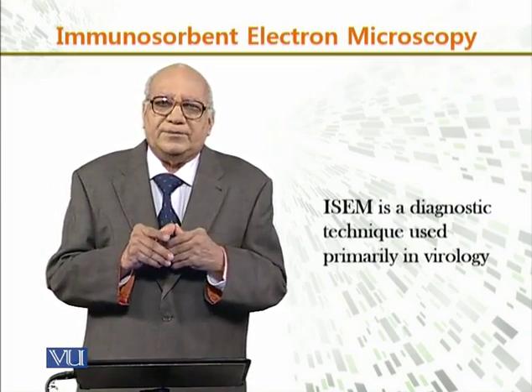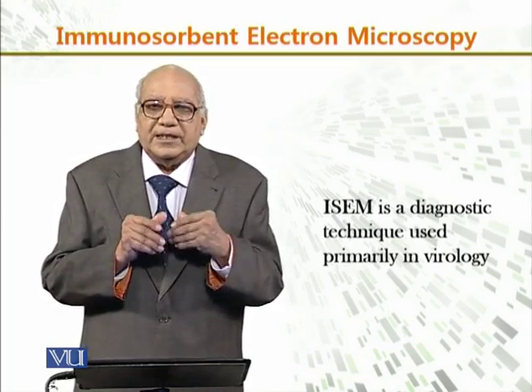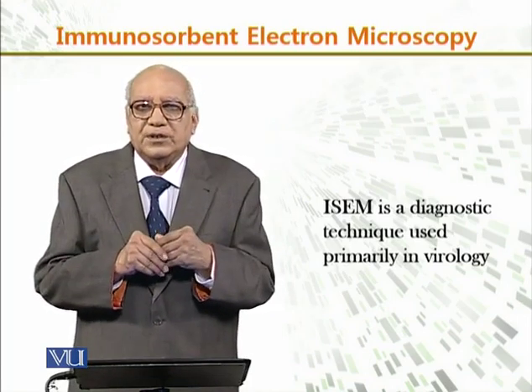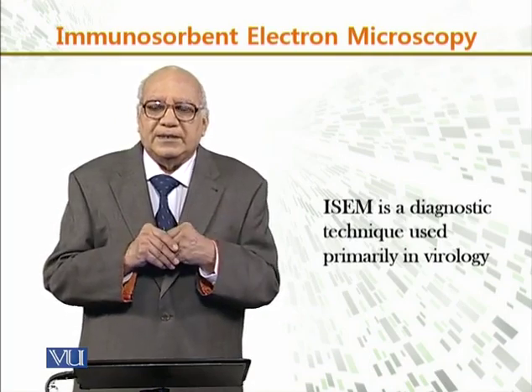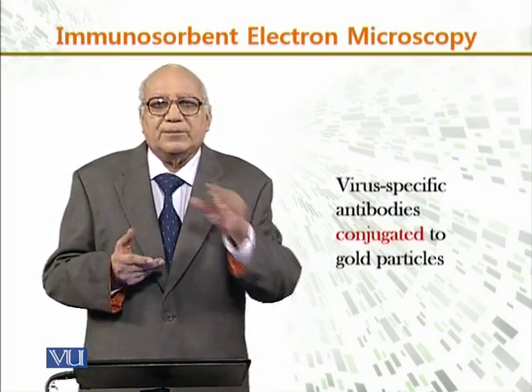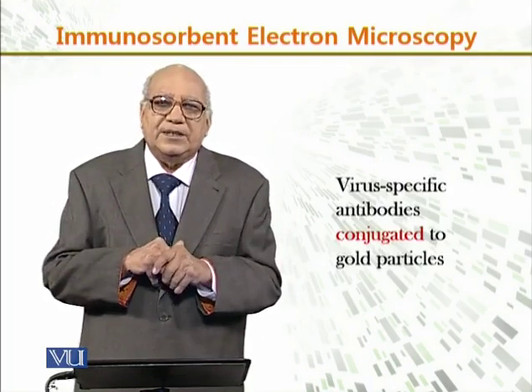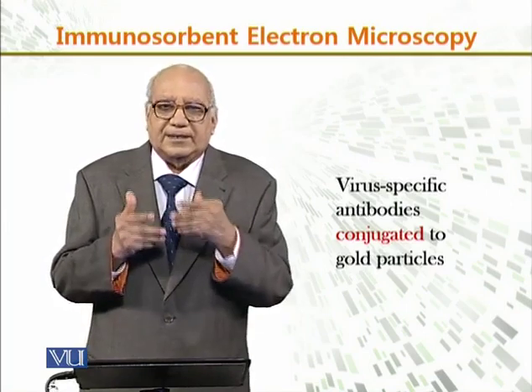But with the help of ISEM, we can diagnose and identify the different viruses which are present, or the virus-specific antibodies which are there.